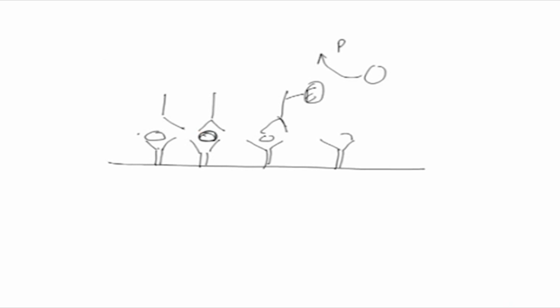In direct coating, there is the problem of a small amount of antigen being coated onto the surface, where other molecules might also bind, and for binding surface this small amount has to compete. That problem could be solved here, because there is a capture antibody which is specific for that antigen.